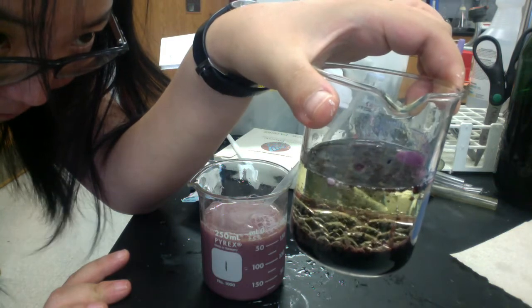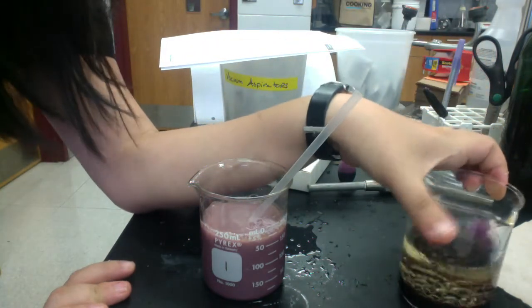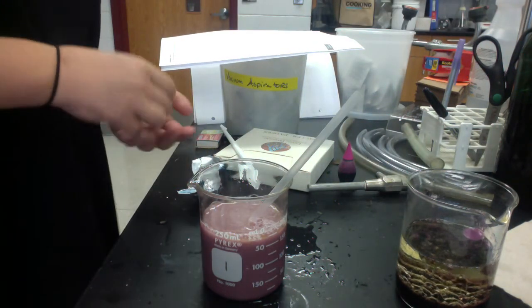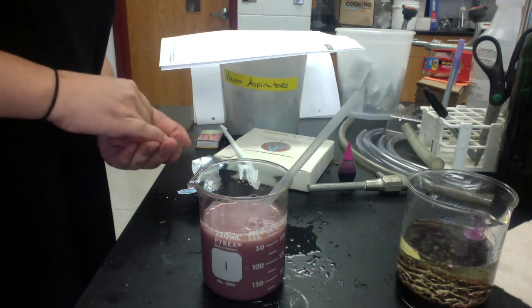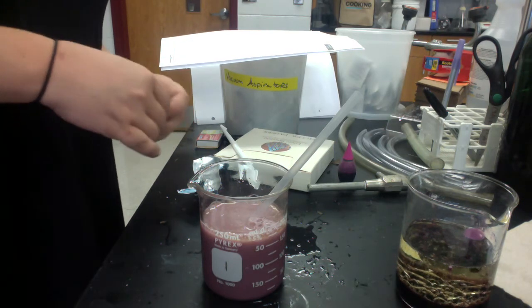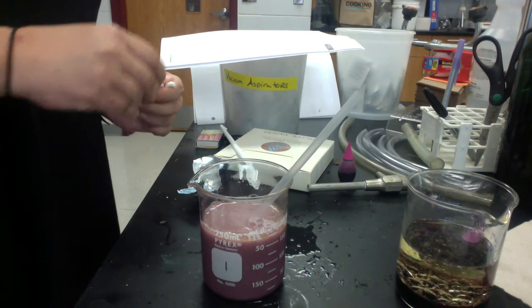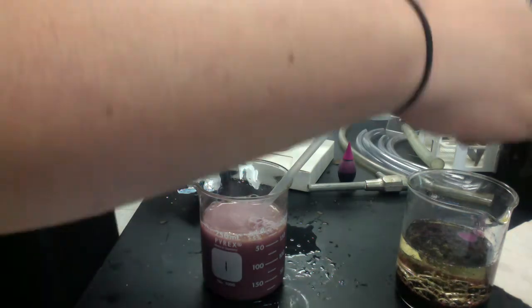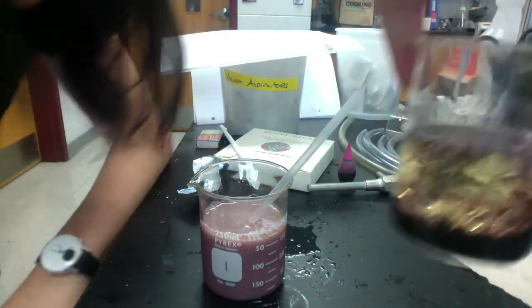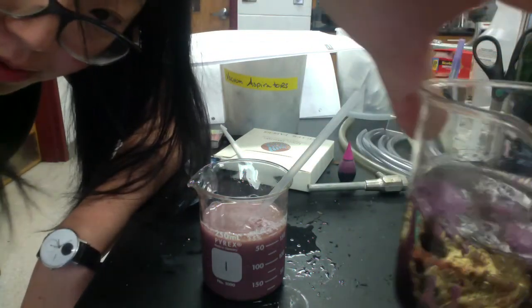All right. I'm going to say that is good. Break the other half of the antacid tab into smaller pieces and drop it into beaker 2. Describe what you see. Whoops. Here we go.